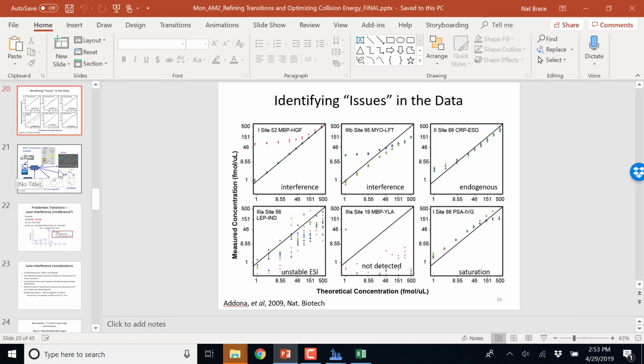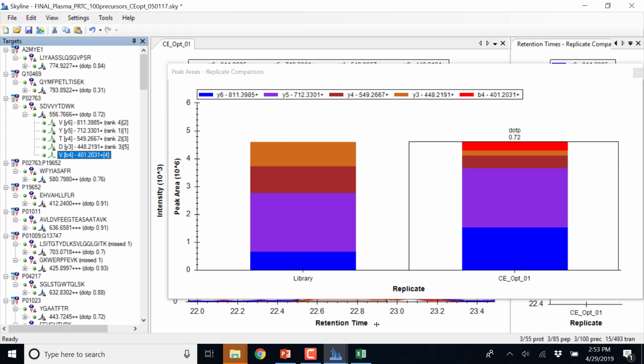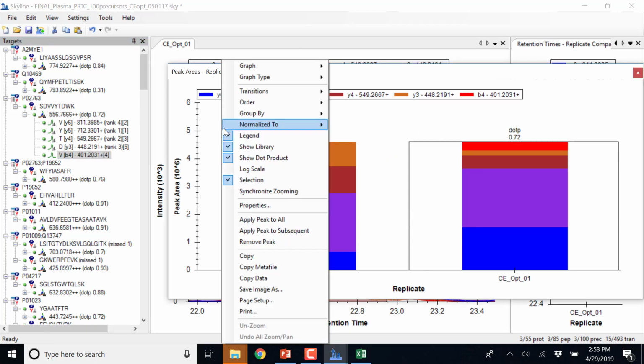Oh, there are other cool things about Skyline you all should know. And this came from us begging Brendan to do certain things. Thank goodness he's very accommodating. If you right click in any of the plots, whether it's the chromatogram or the charts, you see this whole copy section. So there's copy, which copies that image into PowerPoint or Excel. And it's high res enough that you can use it for publication and posters.